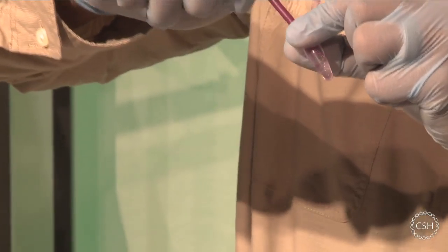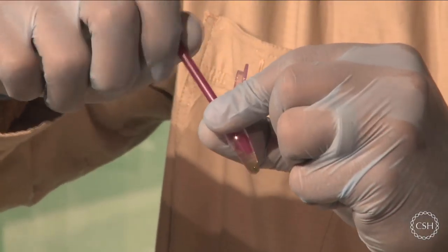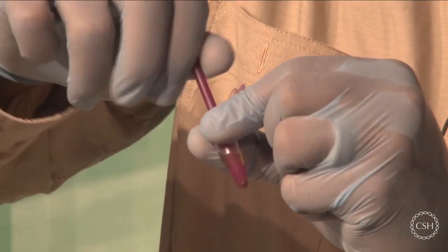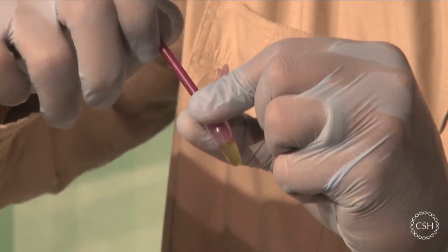What you should notice is that the tissue starts to break up, and even the color of the sample will start to change. And it will be releasing whatever's on the inside of your sample at that time. Since I'm using a plant here, my solution is starting to turn green. But your sample may turn red or brown depending on what other organism you're working with.